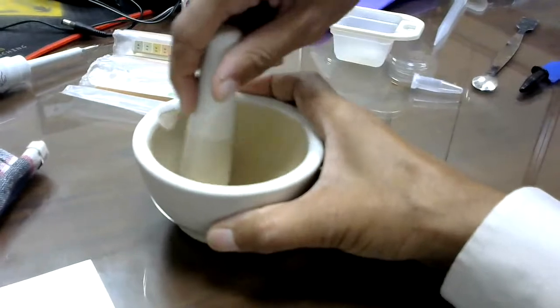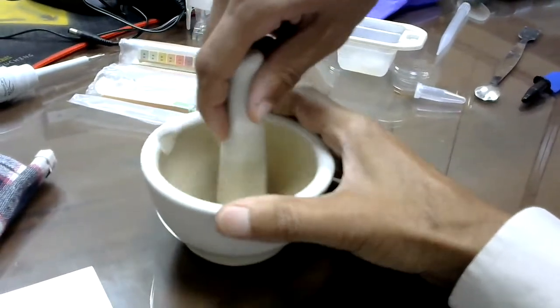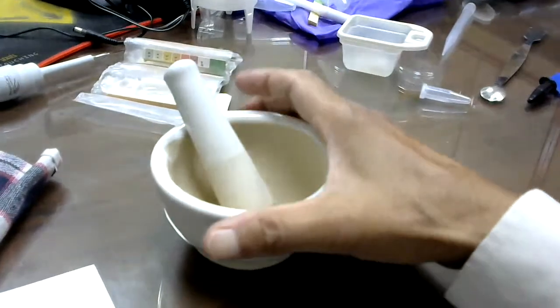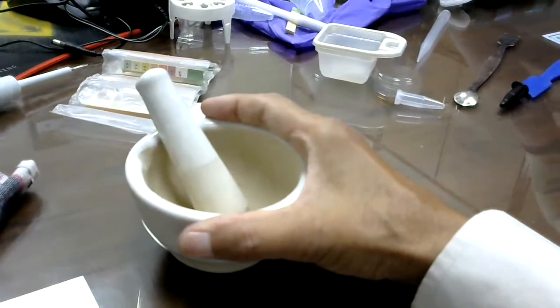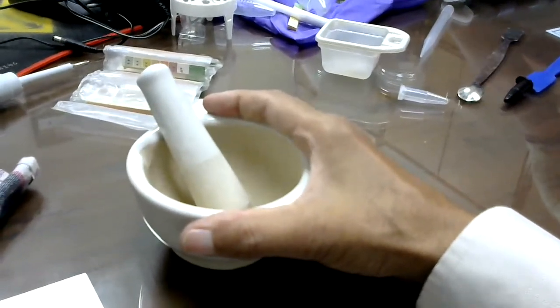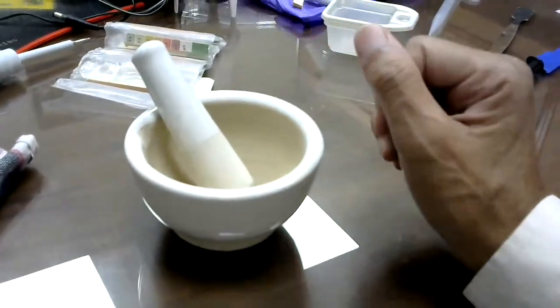Like that, by one hand you have to hold this, because this contains liquid nitrogen. If you hold it like this, your hand cannot hold it for more than 4 seconds. So you have to use cryo gloves.